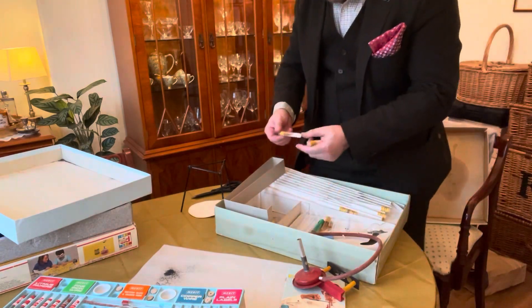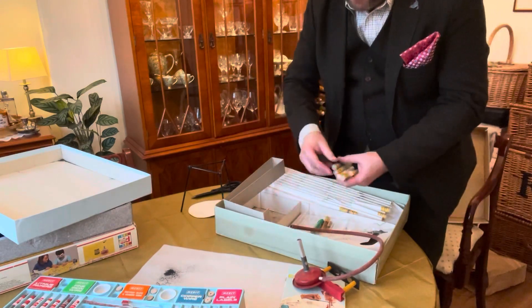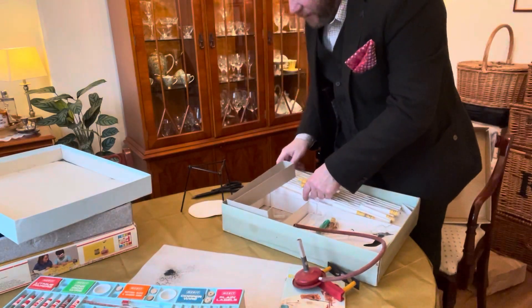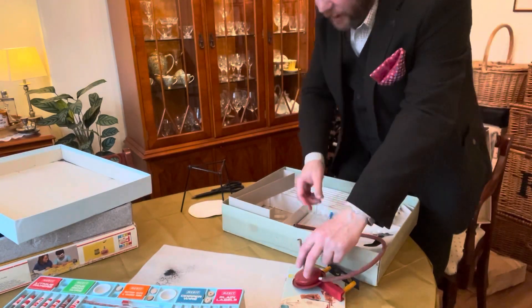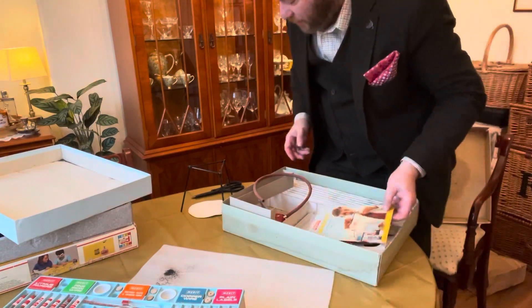Luckily there wasn't a little capsule of glycerine that broke at the same time, or we'd have a nasty spontaneous fire. I don't think there's anything else in here except mess from potassium permanganate, and I've got the dining room table all covered in it. I'll have to clean that up with some dilute sulfuric acid and hydrogen peroxide.